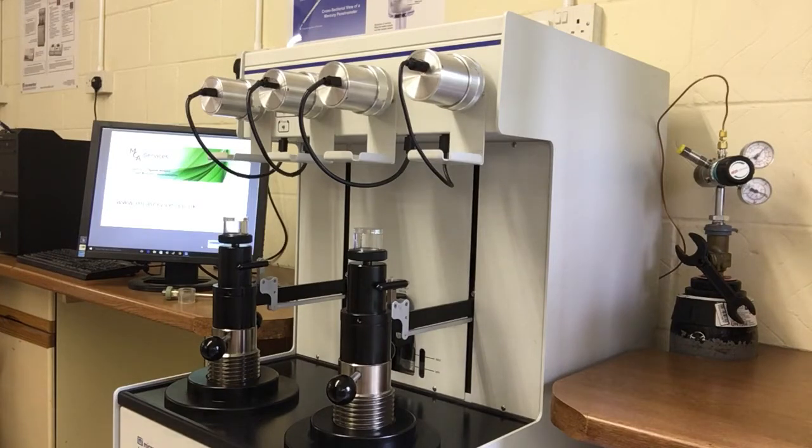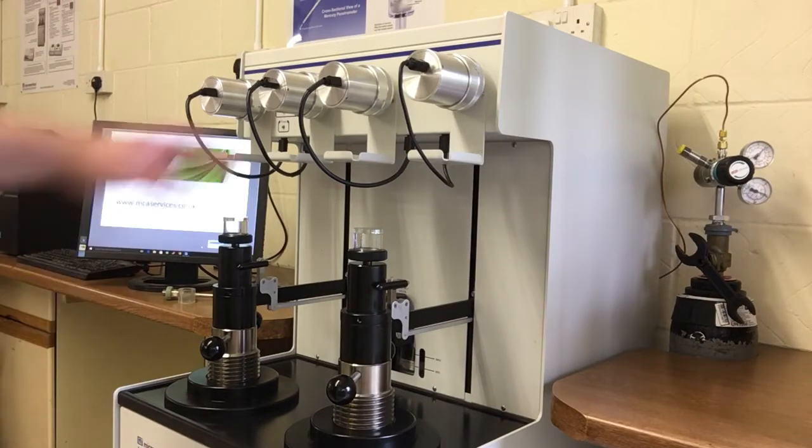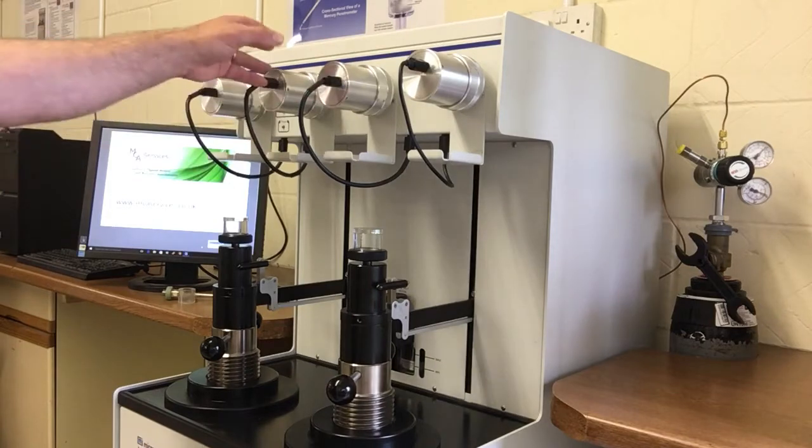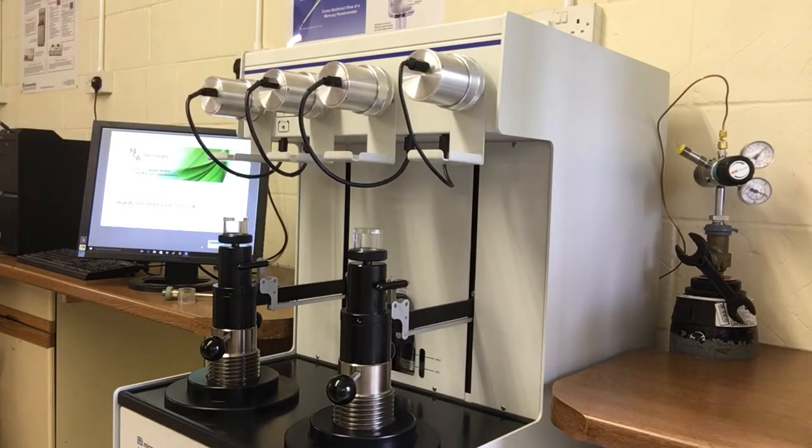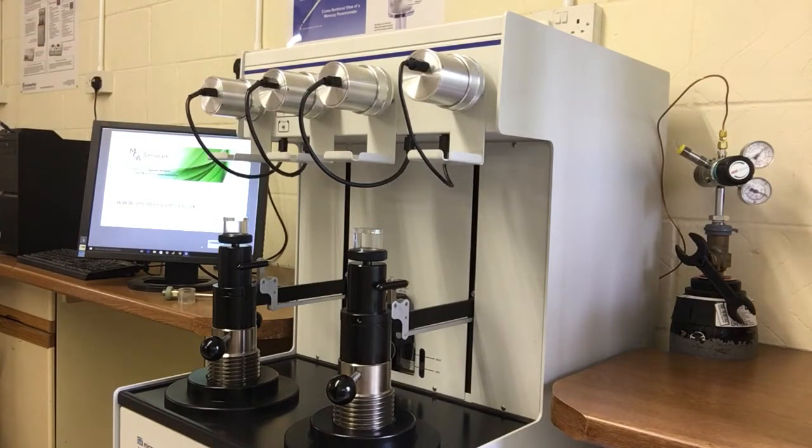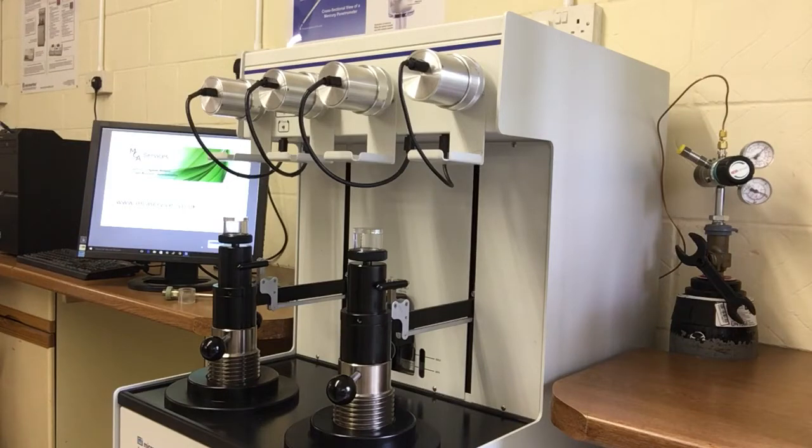At the end of low pressure analysis, the penetrometer will be taken out from here and we may want to weigh it at this stage. And we do that if we're looking to calculate bulk density, skeletal density and volume porosity.